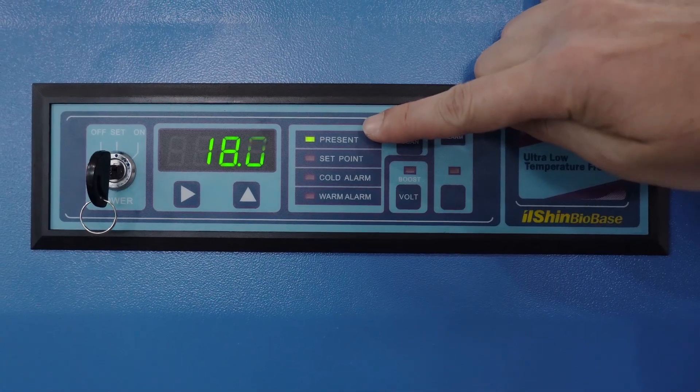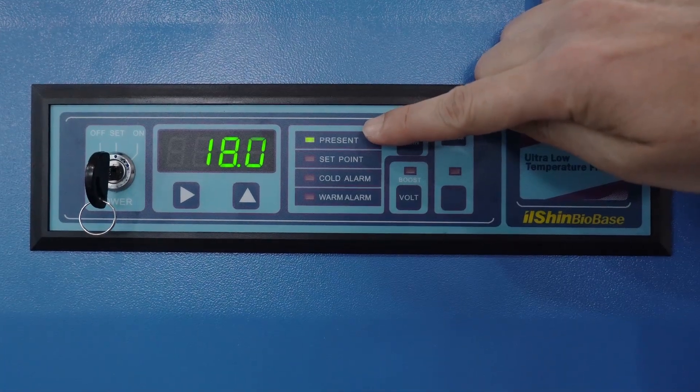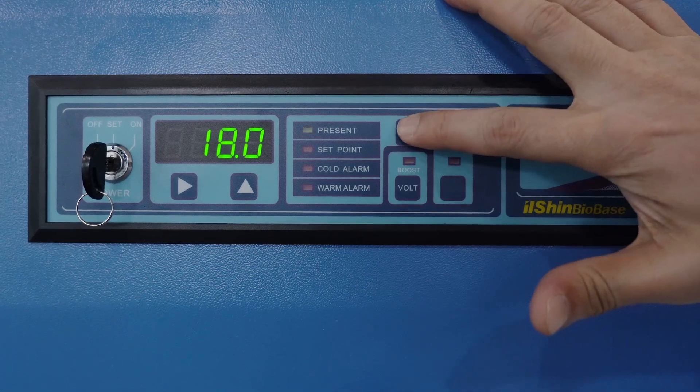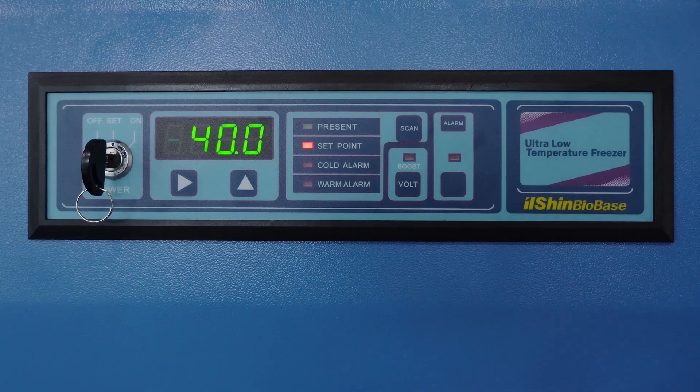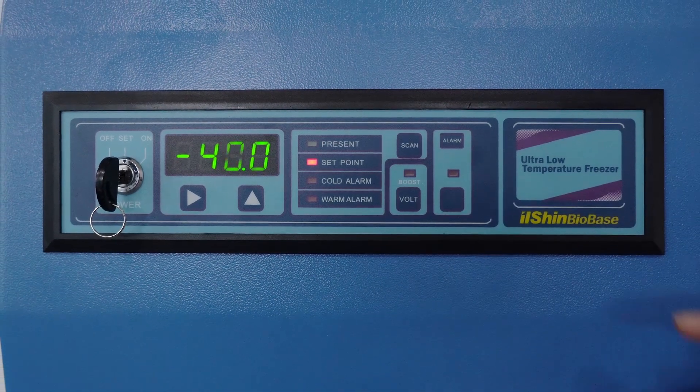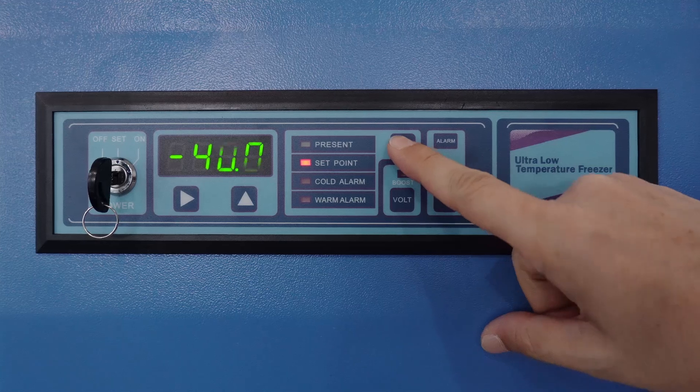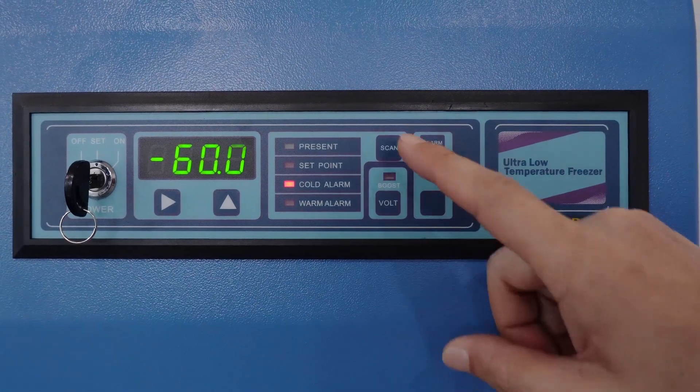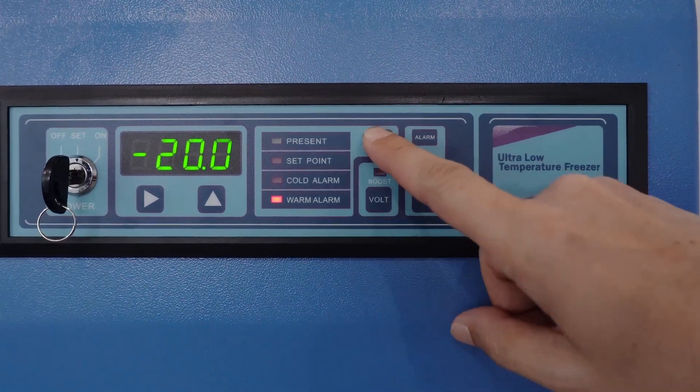Present sign shows current temperature. By pushing scan button, user can check factory setting of set temperature and high and low temperature alarm.